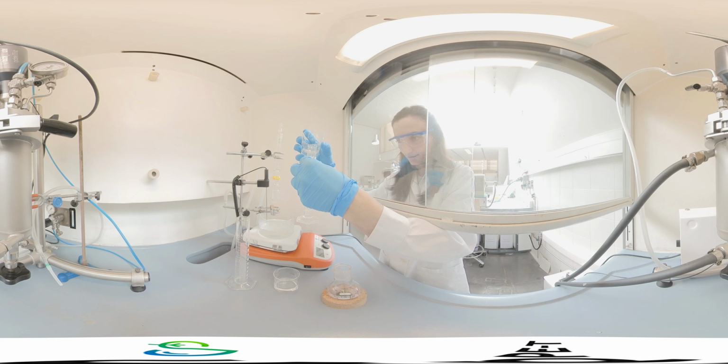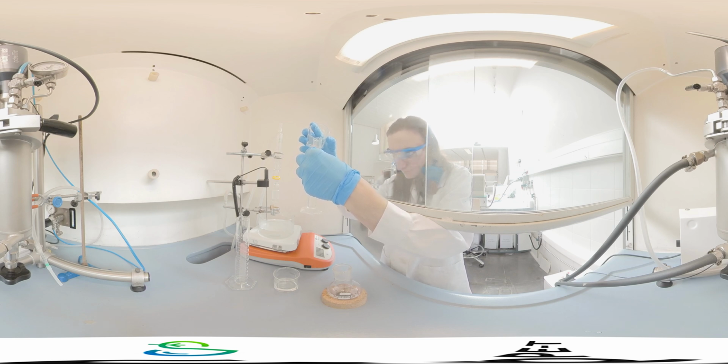Once the purity of ethylene glycol is checked by gas chromatography, the product can be used in the first step of the synthetic route.